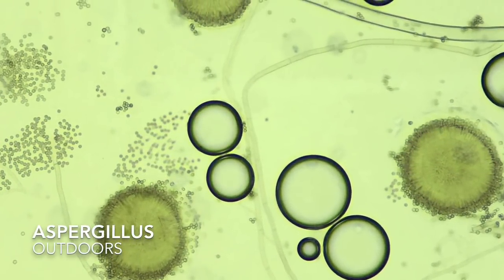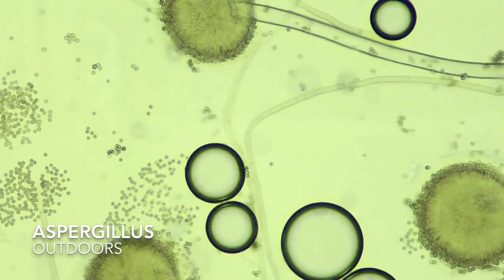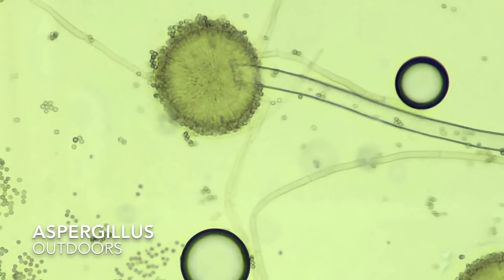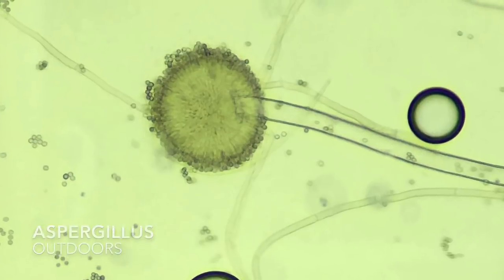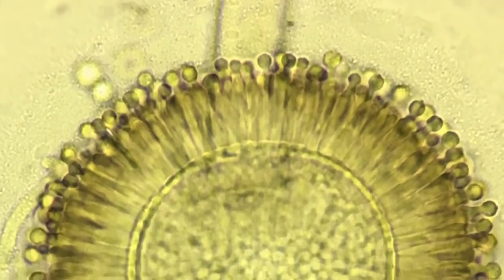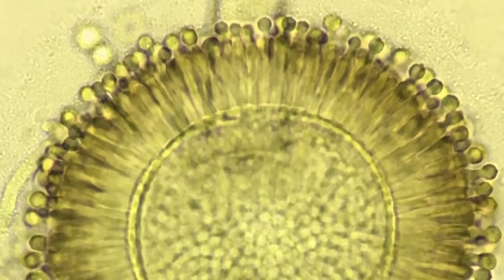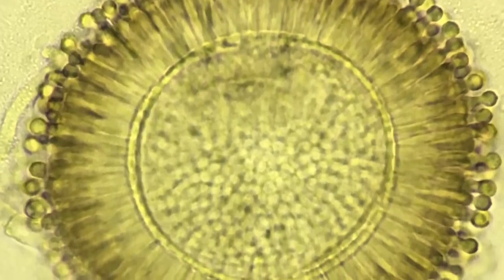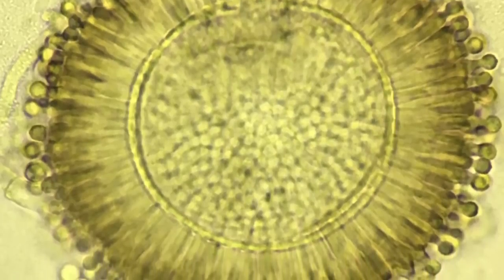Surprisingly, we only had one case with Aspergillus. Aspergillus, like Penicillium, is cosmopolitan and can be found virtually anywhere. Aspergillus can be a genus of concern because certain species are pathogenic to animals. When Aspergillus forms an infection, usually with immune-compromised patients, it's called Aspergillosis.